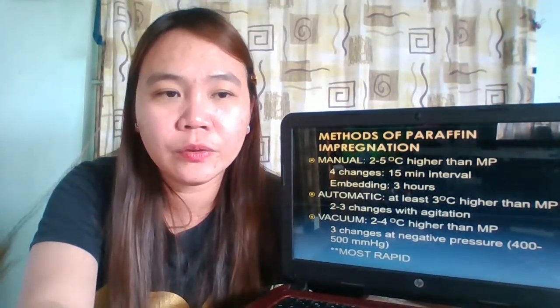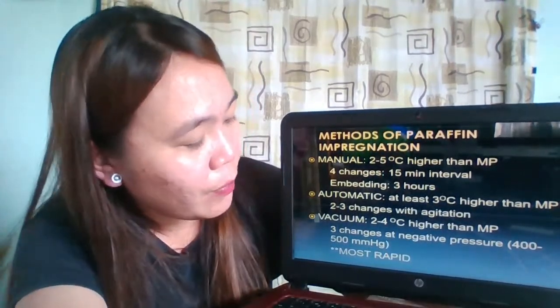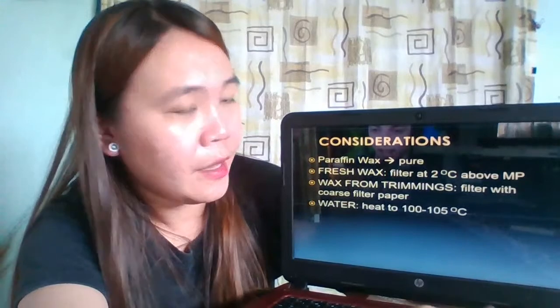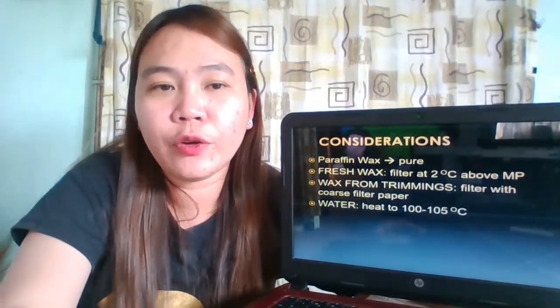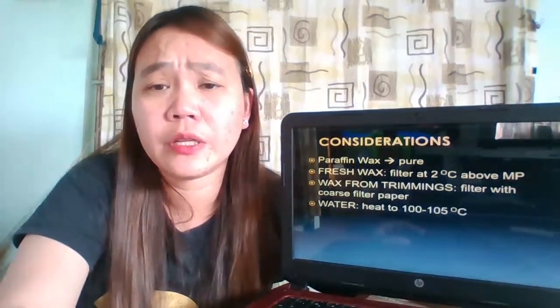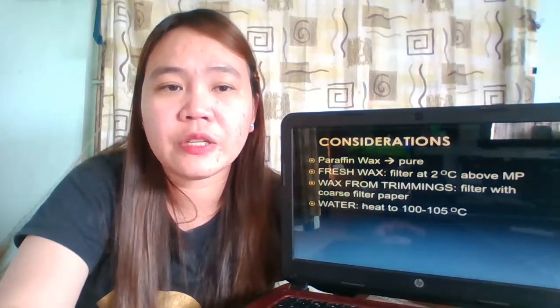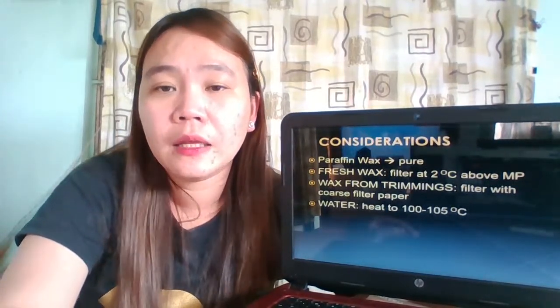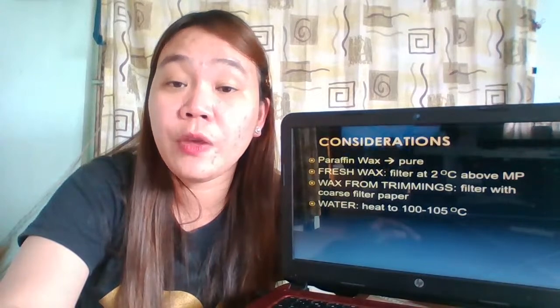Next, we go to the last two slides. Next we go to paraffin embedding. I'm sorry, no, considerations first. So what are the different considerations when we are to make use of paraffin as our reagent? The first one is the purity of your wax. For paraffin wax, you have to ensure that it is pure.